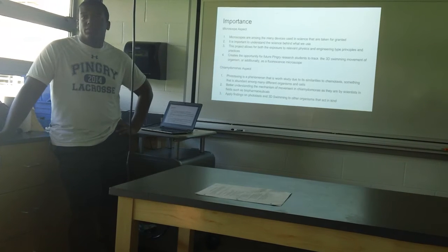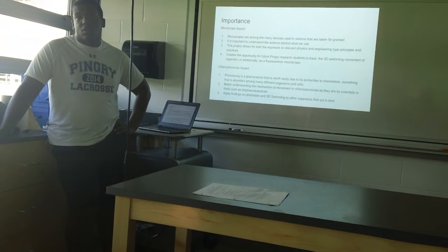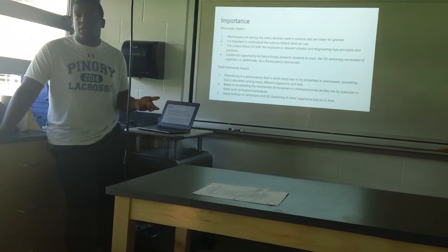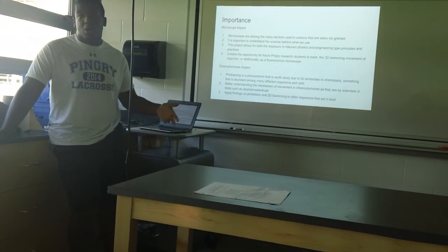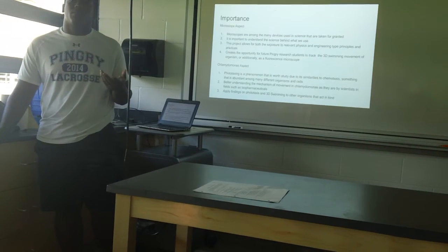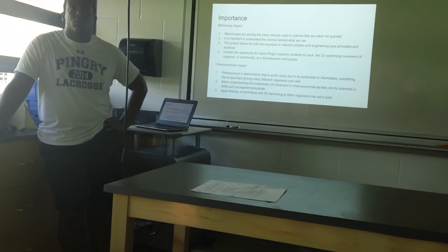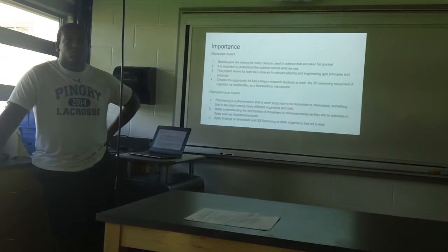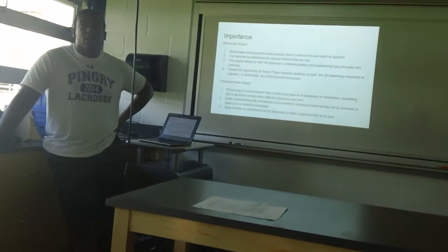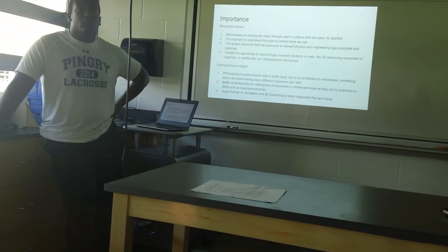So the thing I'm trying to figure out is what you're trying to discover about phototaxis. How it effectively works. On paper, we know how it works, but in practice, we don't. And we would require a 3D microscope to actually view how this works in practice. So you're saying that we have a two-dimensional understanding of it, but we suspect there's more to it than that? Yes. We're trying to see how a three-dimensional view might be different than our two-dimensional understanding.